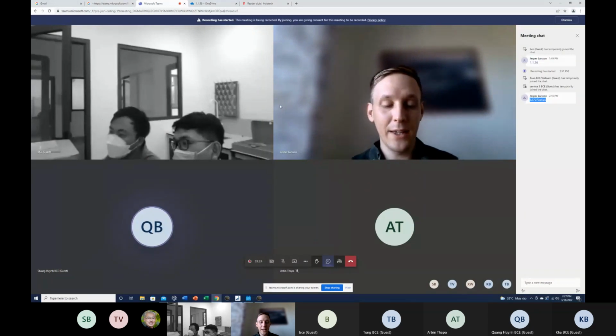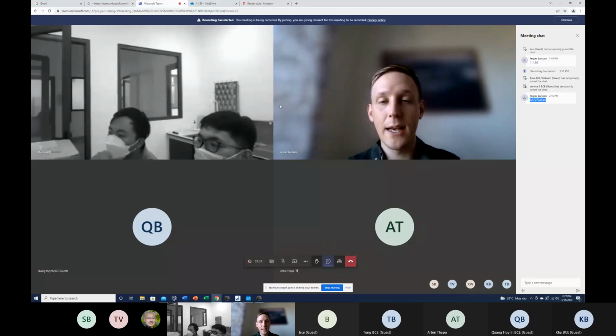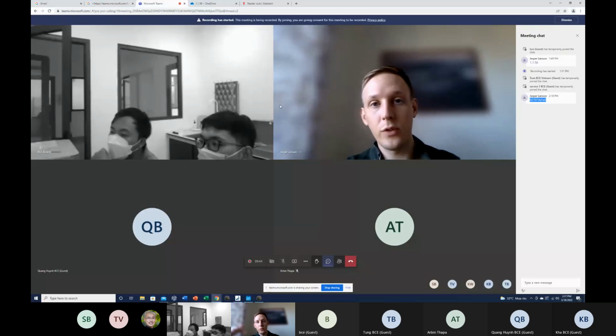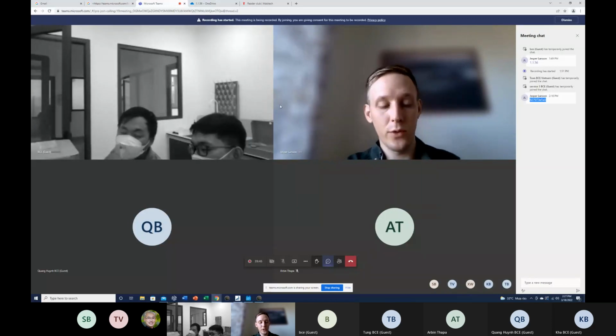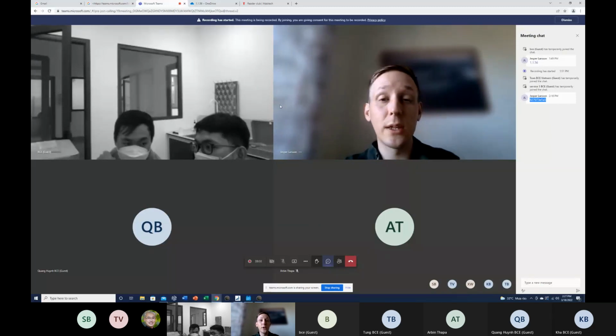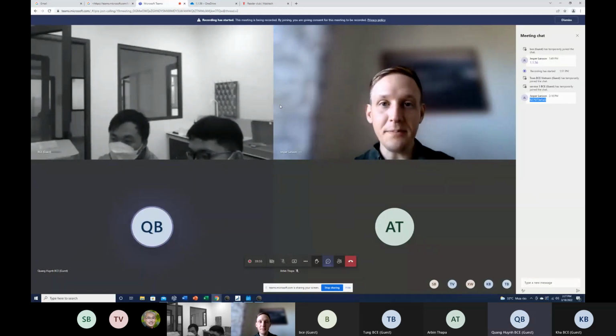Now we didn't say anything about the location, but it could be good: if you're reading it before you ship it to the customer site, then you can save it with the name of the plate and BCE Vietnam. And then you ship the instrument, you bring the plate, you read it, and then you save it with the date and the name of the customer site, so that we know all the time where the different plates are read. Yes, and after that we need your confirmation, right?